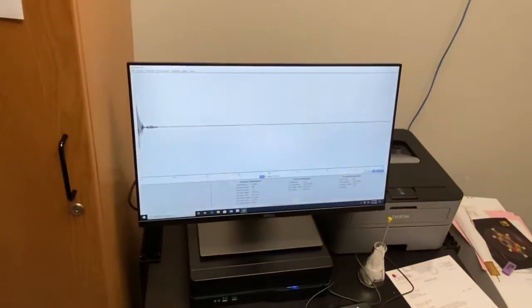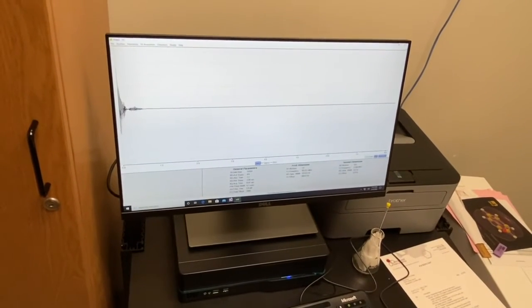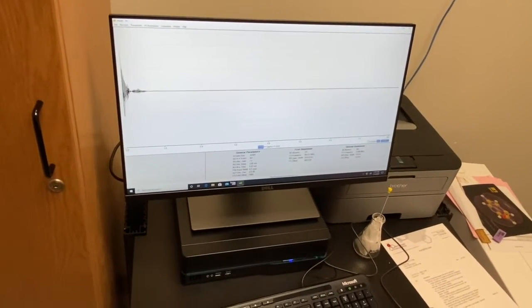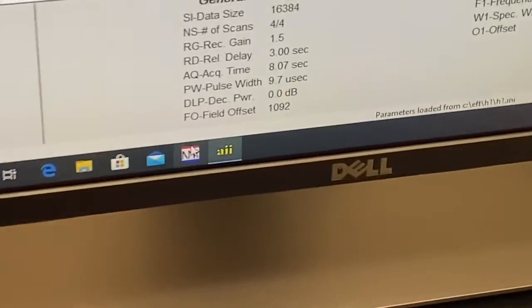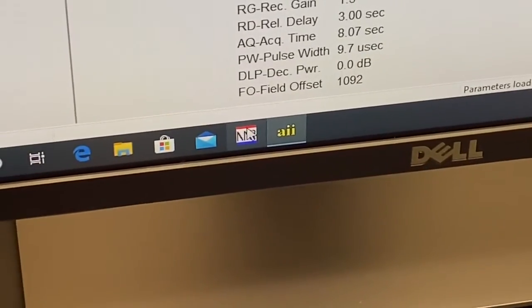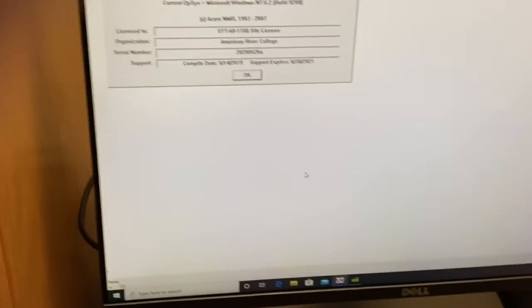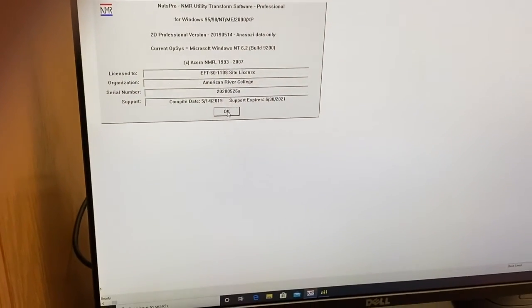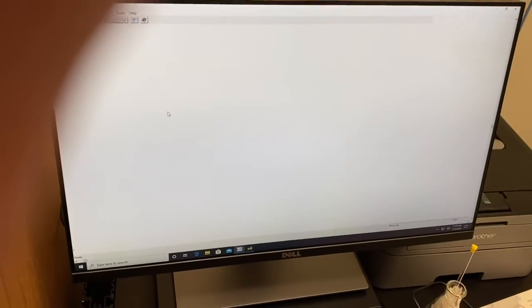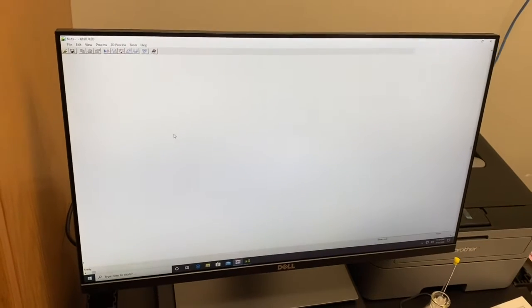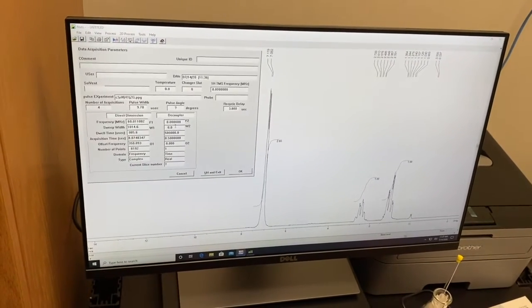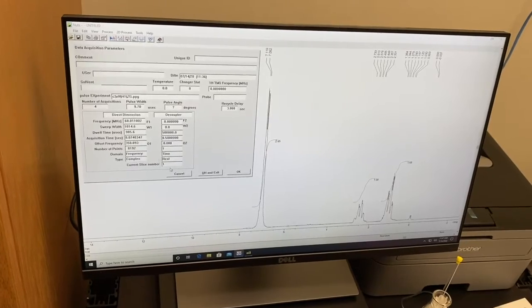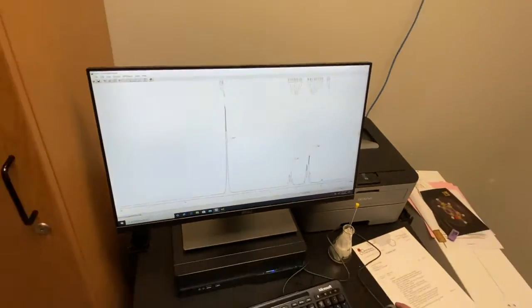Now we need to go to a different program called NUTS to actually turn this into a workable NMR spectrum. You can find that program pinned along the bottom. It actually says NMR. Click on that. A window shows up. Just hit OK. Now we need to transfer the data over to this program. Hit CTRL F1. This window pops up. Just hit cancel. There's our NMR spectrum.